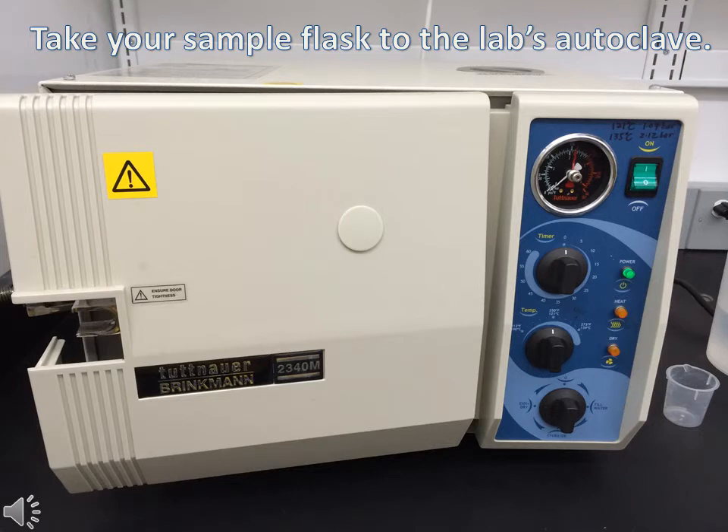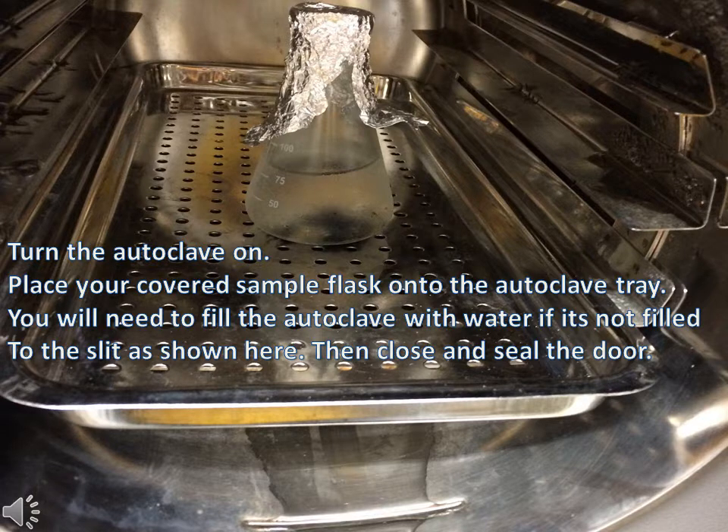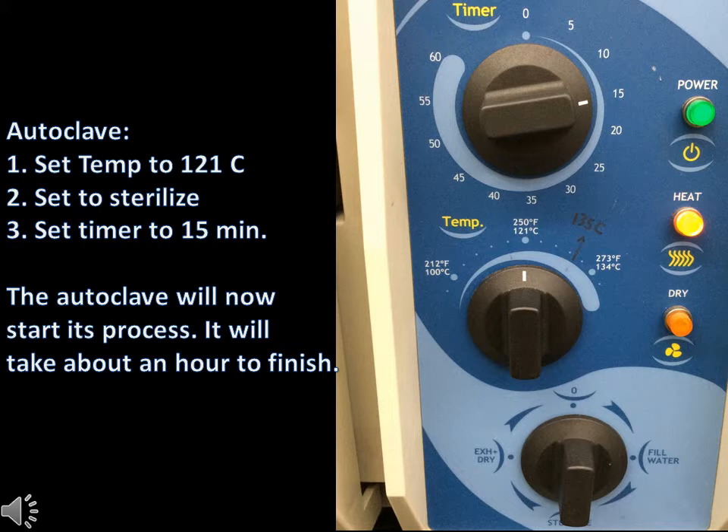Bring your flask to the lab's autoclave machine. Turn the autoclave on and place your flask onto the tray. You'll need to fill the autoclave with water if it's not visible on the slit on the bottom. Then close the door. Set the temperature knob to 121 degrees Celsius and then set the bottom knob to sterilize. To begin autoclaving, set the timer to 15 minutes.